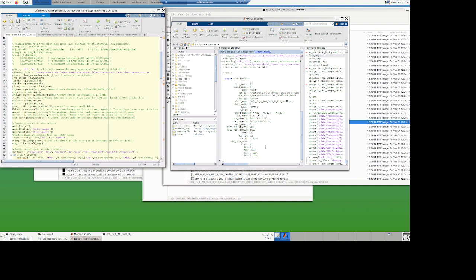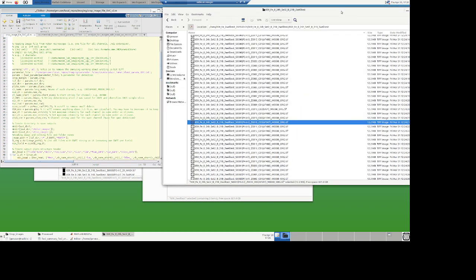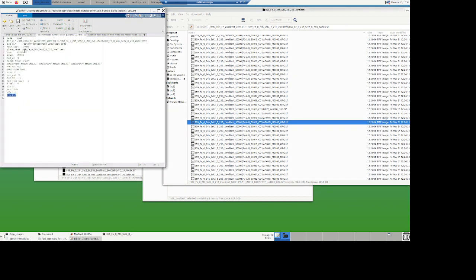One way to do this is you can just call the function here, and it's just crop image. Don't pass any parameters, and it should start doing the work. So what it's going to do, let's go back to the output now. If I look at my output directory, plate name, out, so that's my out directory. Let's see if that thing exists.